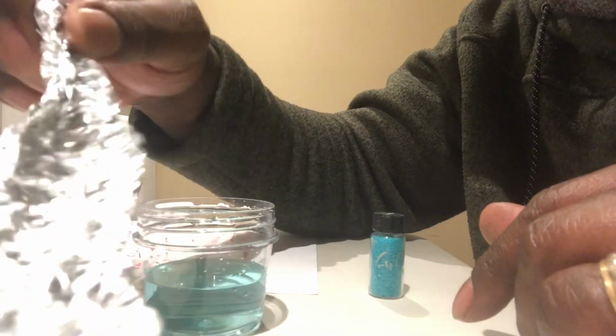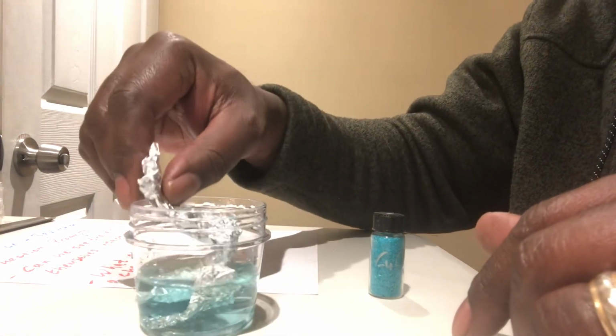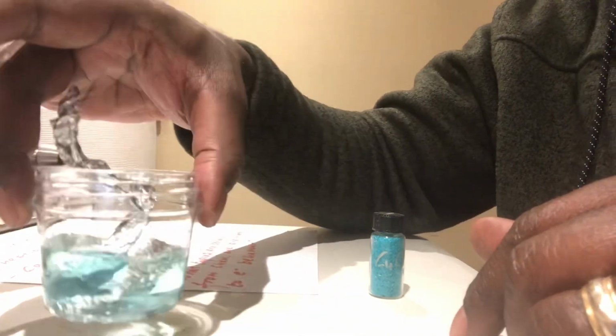So guys, I just want to show you something very popular. See this right here? Aluminum foil, nice, shiny. I'm just showing you the before situation. Okay, so I'm going to put it in right here now. All righty. Give it a swirl. I'm going to leave it there for a while.